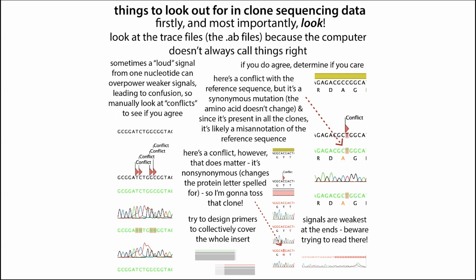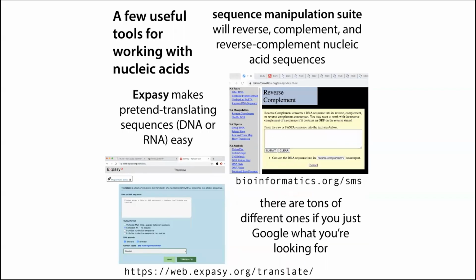Sometimes you're like, where the heck does this come from? It's not matching any place in my plasmid. Sometimes you might see a sequence that matches elsewhere in your plasmid, not where you were expecting. You might see just the plasmid, the vector, instead of seeing your insert in there. But sometimes you can't even figure out where this sequence came from. Then you can do BLAST and look up the sequence to see where it came from.